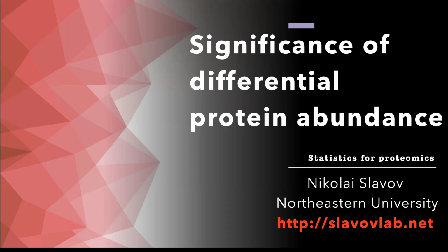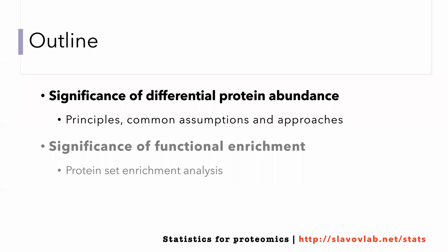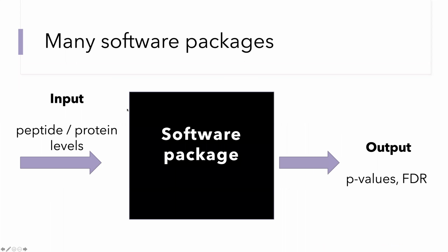Welcome back devoted to statistics for proteomics. The topic of discussion today is going to be focused on estimating the significance of differential protein abundance. And the next time we are going to discuss a related topic, which is the significance of functional enrichment of differentially abundant proteins.